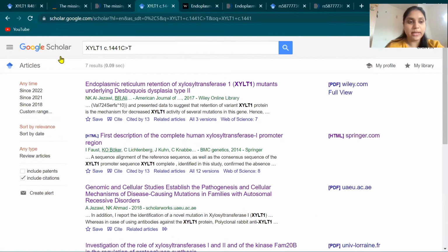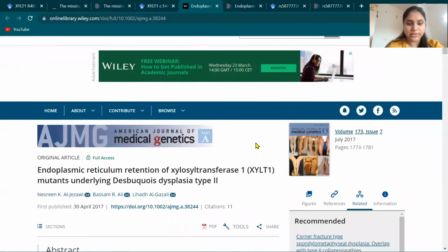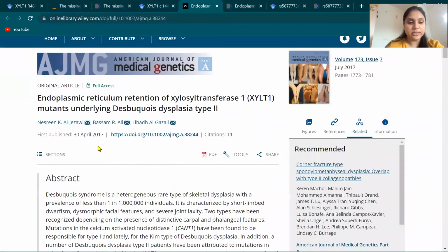For example, here I have put in the cDNA change in Google Scholar and I got 7 results, from which we have to read all these papers. However, because of the time constraint, I will only show the first result, which is this 2017 paper.